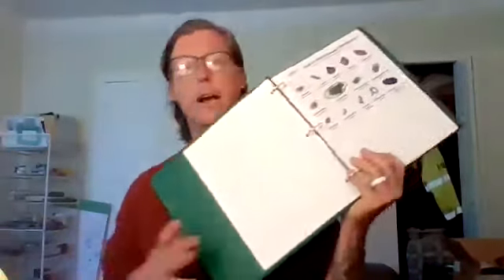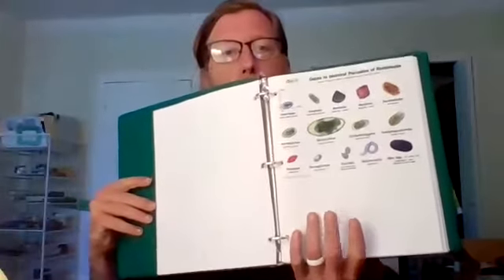All the instructions are in your booklet. The best instructions are in this one here. Basically, you can read this little packet here that starts with this beautiful picture, and it will give you exactly what I'm about to do here. It doesn't take long to do this.